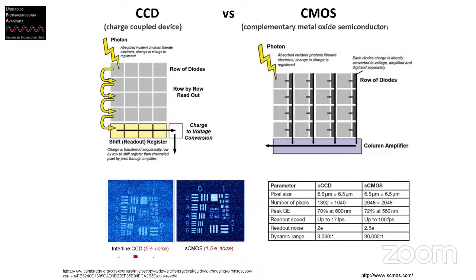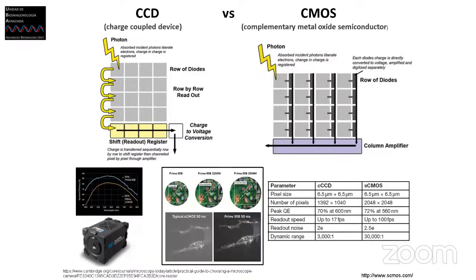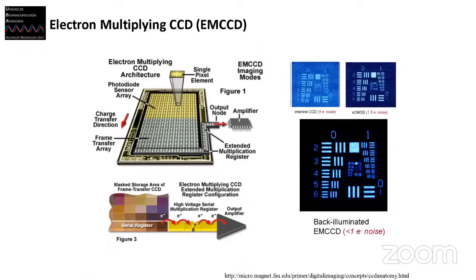And you see that even CMOS, if they are good, and now they are getting very, very good, you can get really decent images. And this is one that we use in the LFD many times for many of the papers, as some of the results that I will show with the light sheet microscope, I think Wednesday.